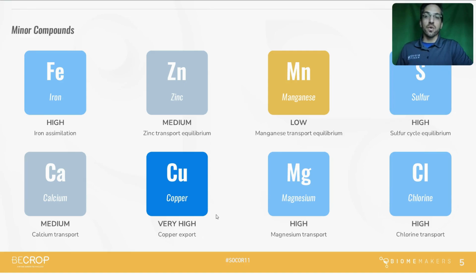And then finally, we offer indications of your soil's capacity to mobilize into a plant available form these 8 micronutrients. Is there anything more I should say about that? Probably there's a lot more I should say about that. In broad strokes, we would like to see a score between medium and high. Those are ideal scores. Those suggest that we have the capacity to mobilize these micronutrients into plant available form without mobilizing them so much that they could become phytotoxic.